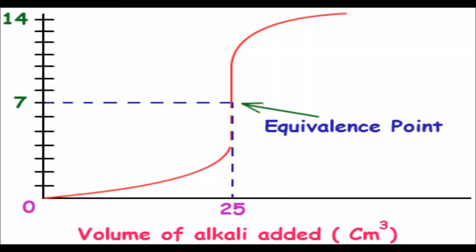In this graph, it shows the equivalence point. Equivalence point is a point when pH is neutral. It means that the amount of sodium hydroxide is equal to the amount of hydrochloric acid. But in this lab, we use phenolphthalein as a pH indicator. So we have to use the endpoint instead, because phenolphthalein changes color when pH is around 8.4 to 9.0.